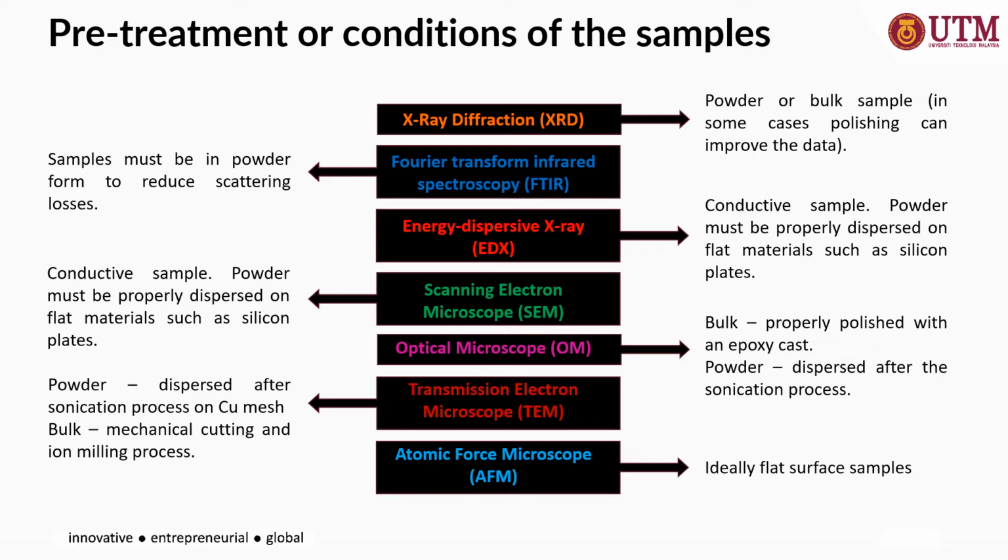For the atomic force microscope, ideally the sample must be a flat surface. So you need to prepare your sample as flat as possible.